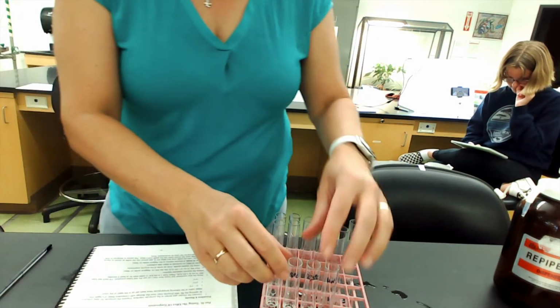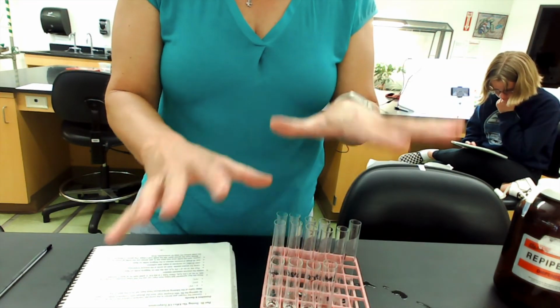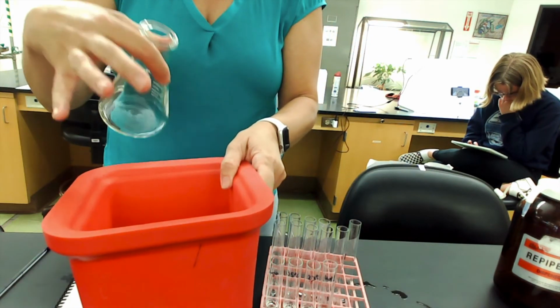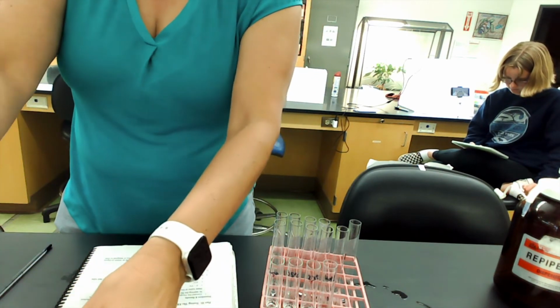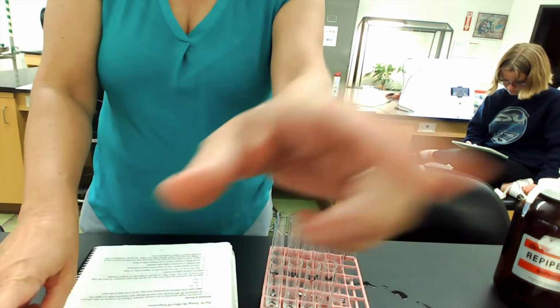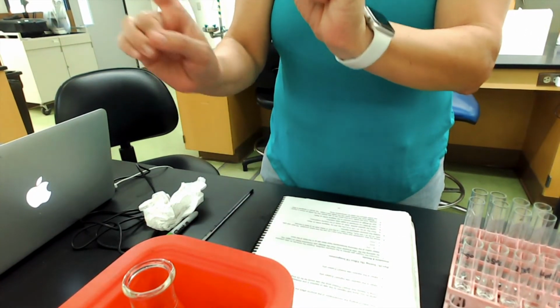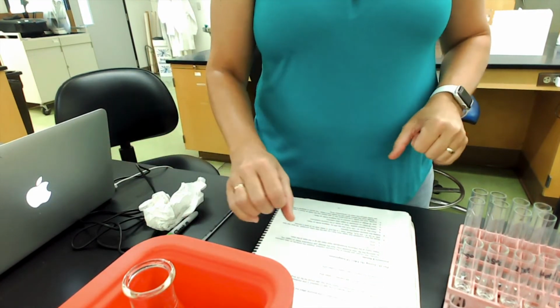So number 1 is put the tubes in their different temperatures for at least 10 minutes. Create a mini water bath of the same temperature here. Pour the substrate into the mini one, add the enzyme, put the little reader magic wand in, turn it on, and let it go.